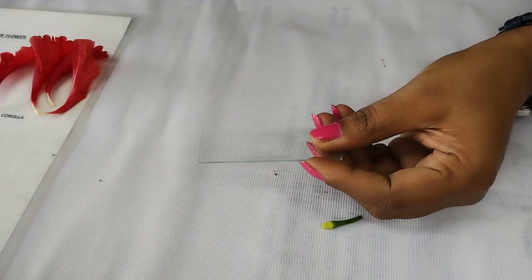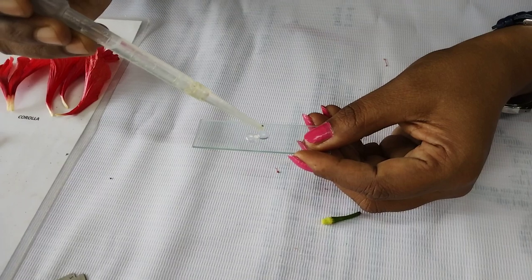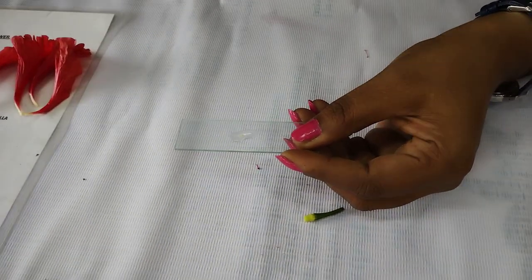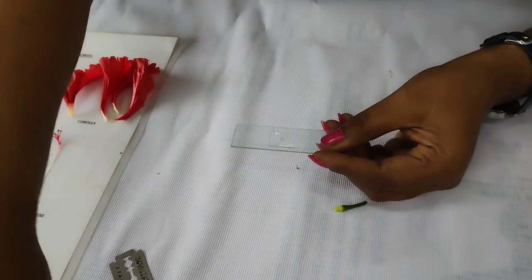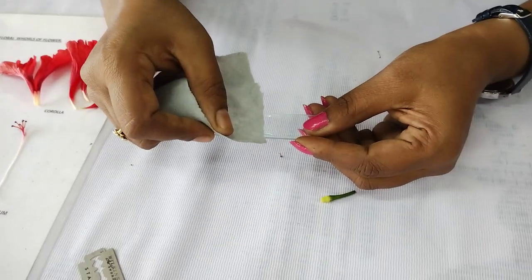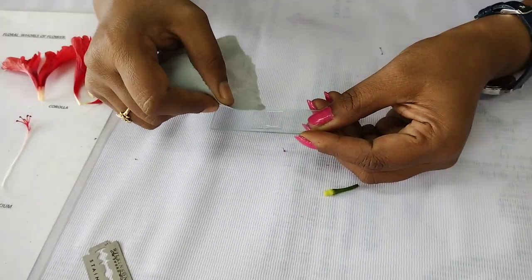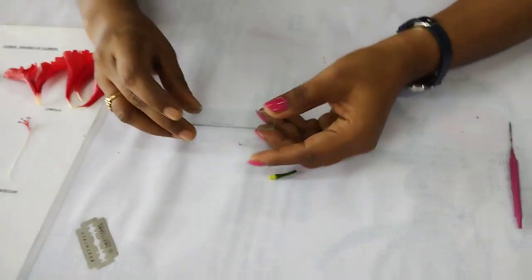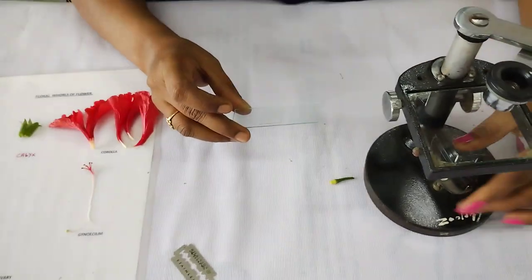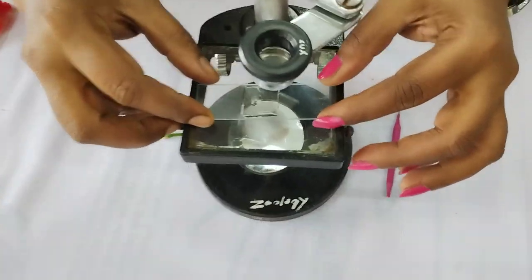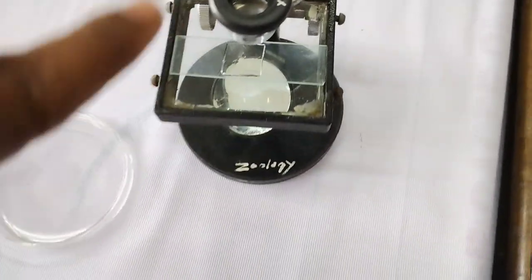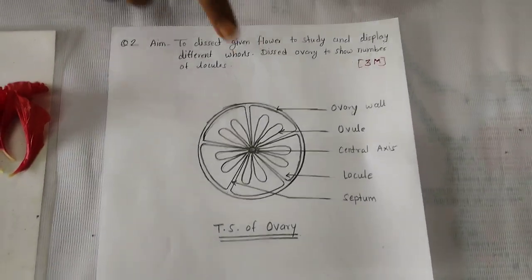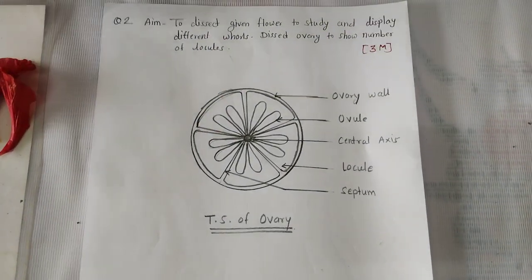Place the section on the slide and add one drop of water. Take a cover slip and wipe excess water with filter paper. This slide is now ready — it is the TS of the ovary. Take a simple microscope, adjust it properly, place the slide on the stage, and observe. Draw the diagram showing five locules, each containing two ovules, and label accordingly.